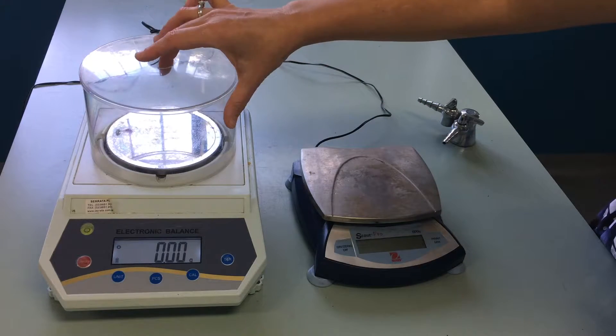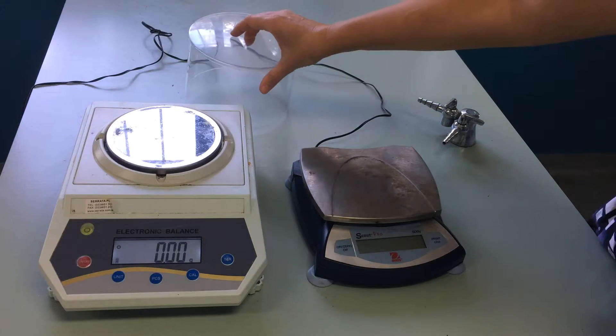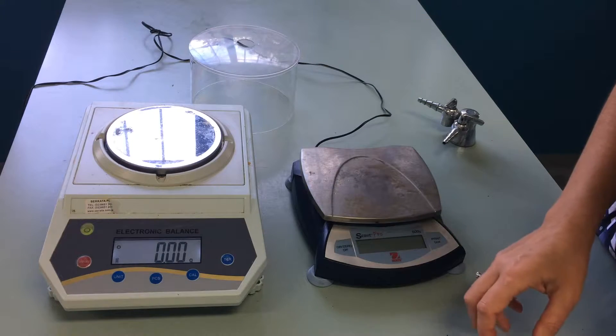If your balance has a lid like this one does, take it off, and now it's ready to weigh your object.